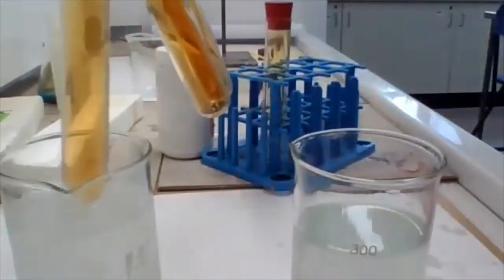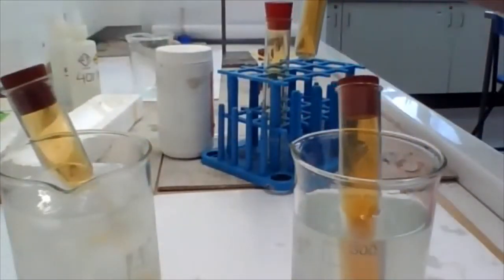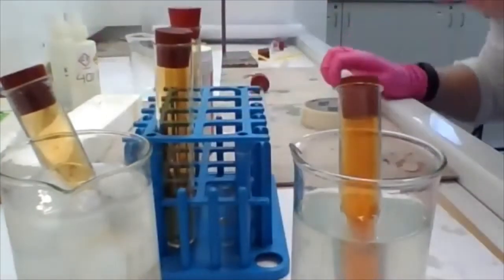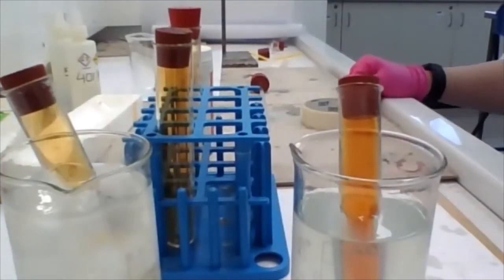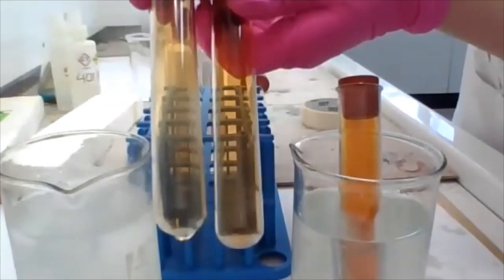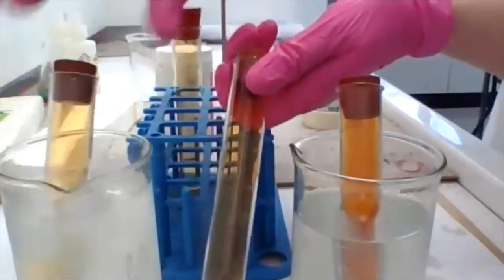You can see that they are all roughly the same colour. I'm putting the left one in the ice and the right one in the hot water, and I've still got that control in the middle. So you can see that that reaction is very nearly instantaneous. You can see a distinct difference between my test tube on the left, which is in the cold water, and my test tube on the right, which is in the hot water.